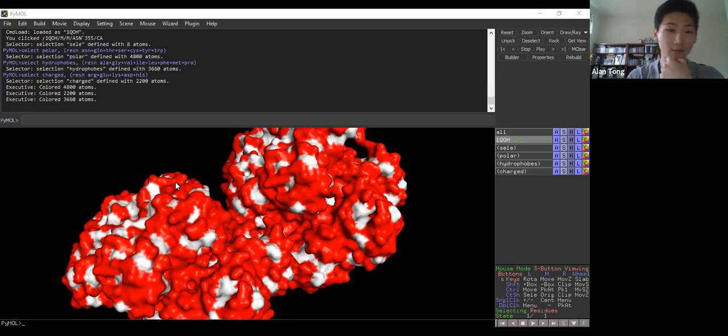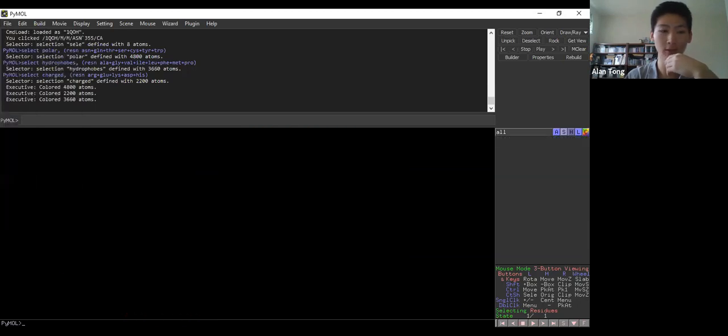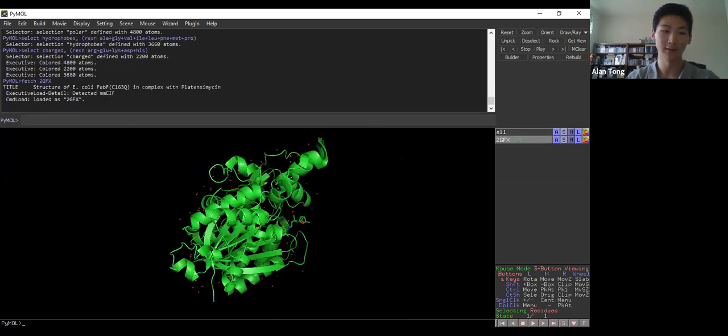You can identify the similarities of a protein found in two species. Exactly, right? If two species are closely related, or if their genes, we can describe gene lineages. If their genes are closely related, we also expect their protein shapes to be related. Let's do that, right? So we can also fetch multiple molecules. So here I will fetch 2GFX, and I will also fetch 1TQY. Fetch 1TQY, and I have these two proteins here, right?